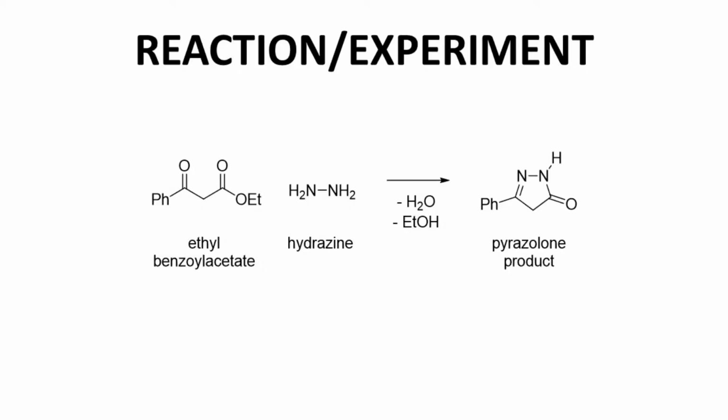The reaction in this video shows the formation of a pyrazolone. Specifically, our ketoester is a molecule called ethyl benzoylacetate. And then the hydrazine will be regular, unsubstituted hydrazine, NH2, NH2.